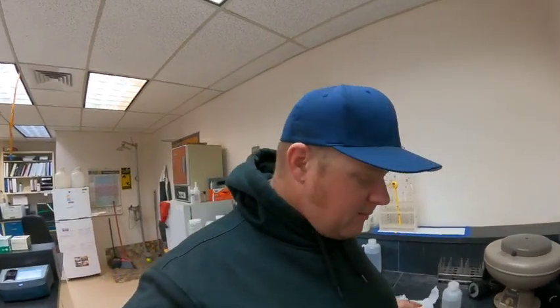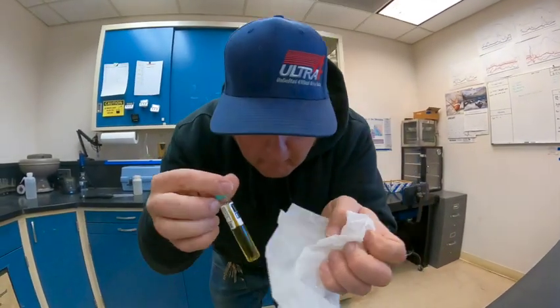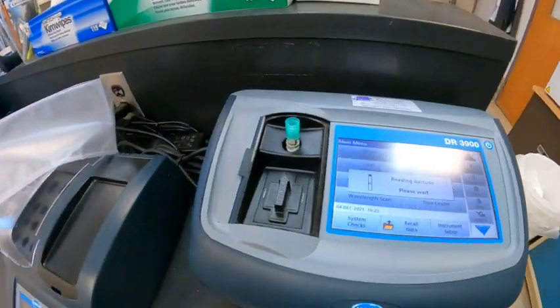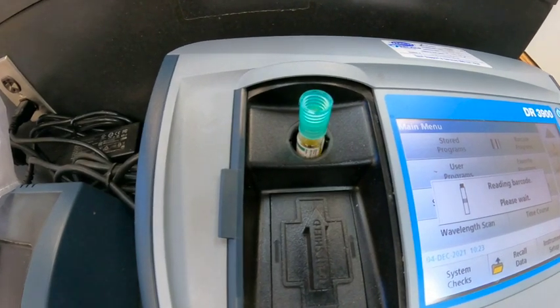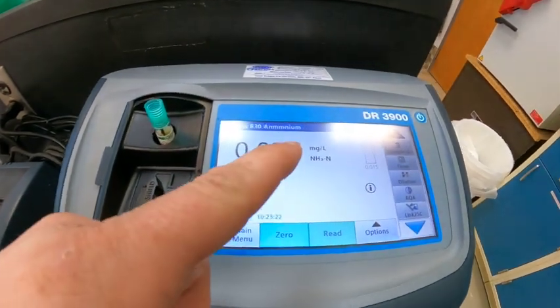Time's up. Time to read the TNT. .030, that's what our ammonia is. Outstanding.